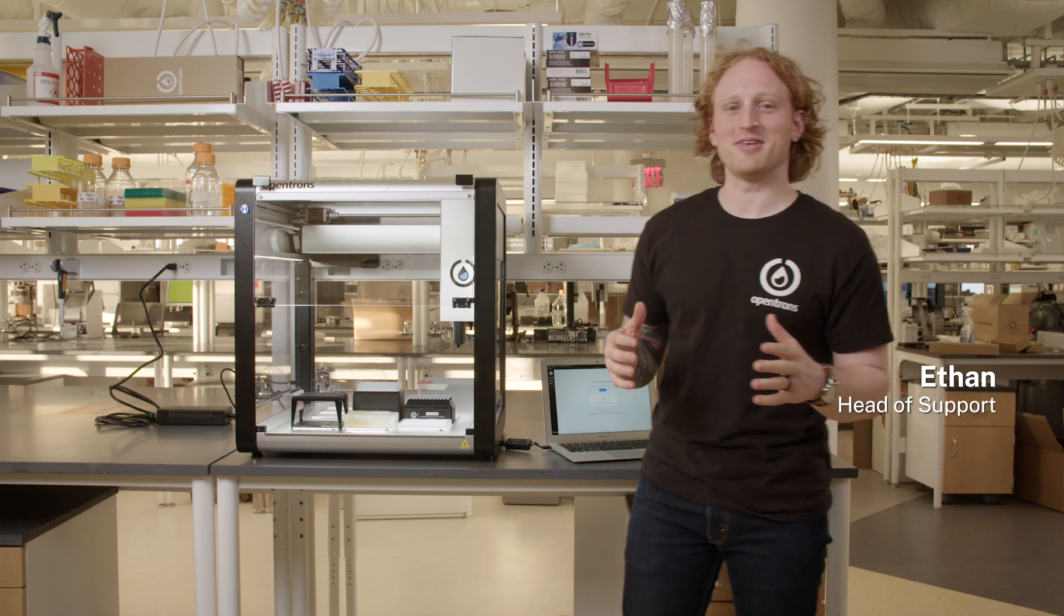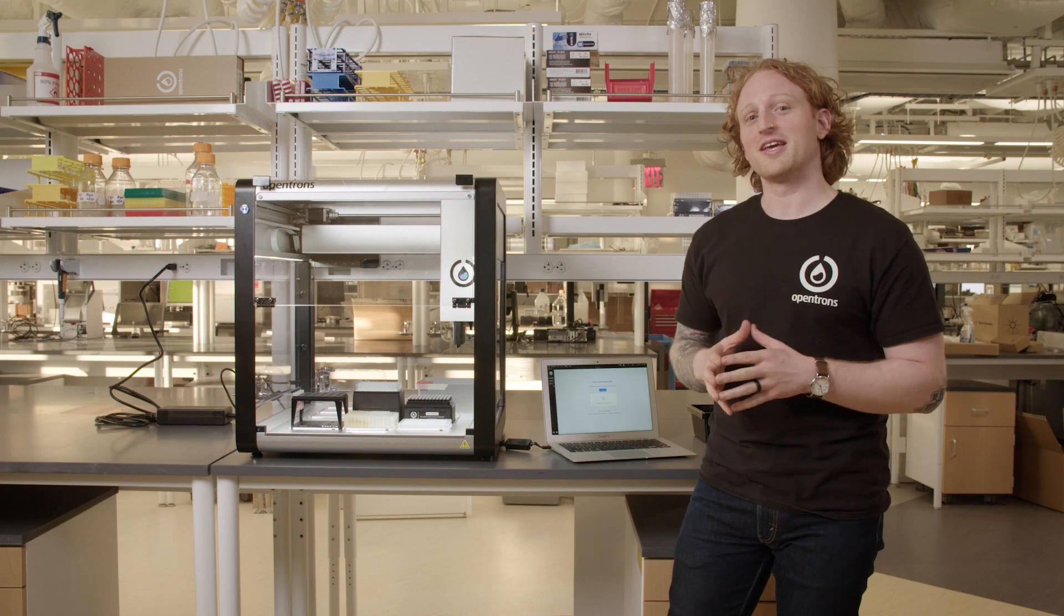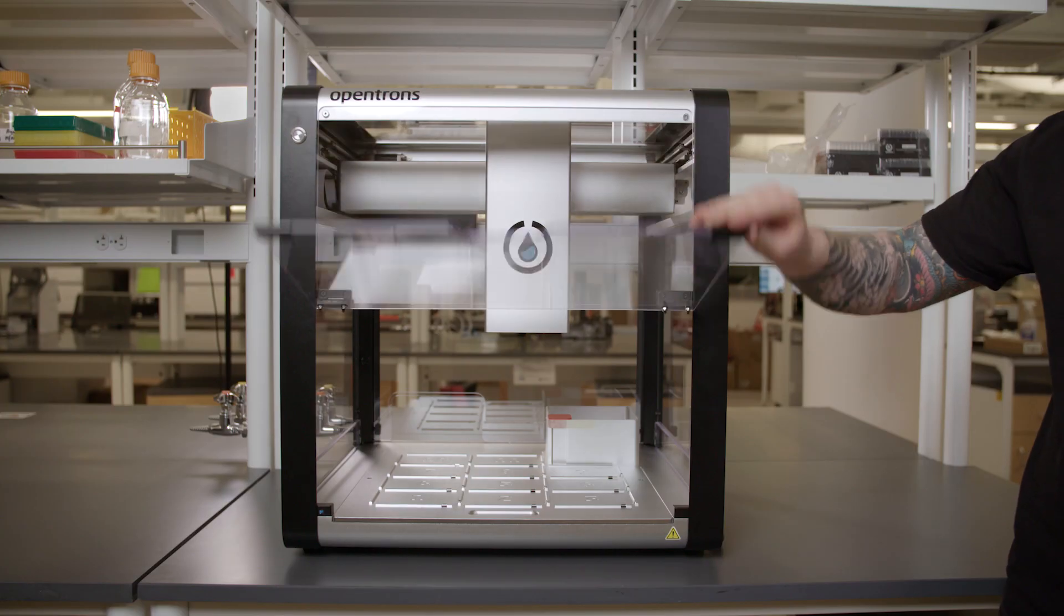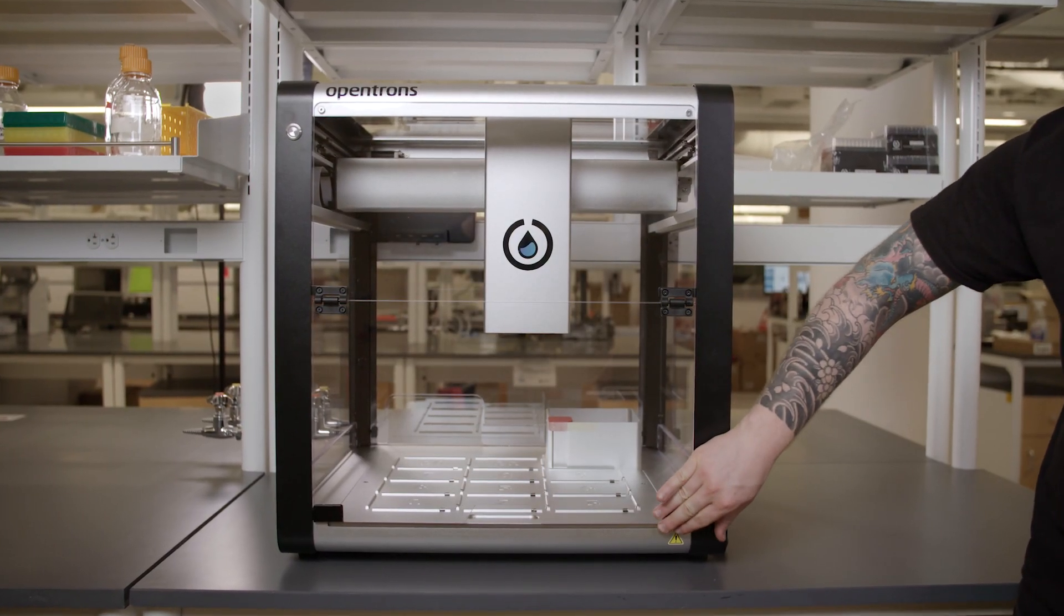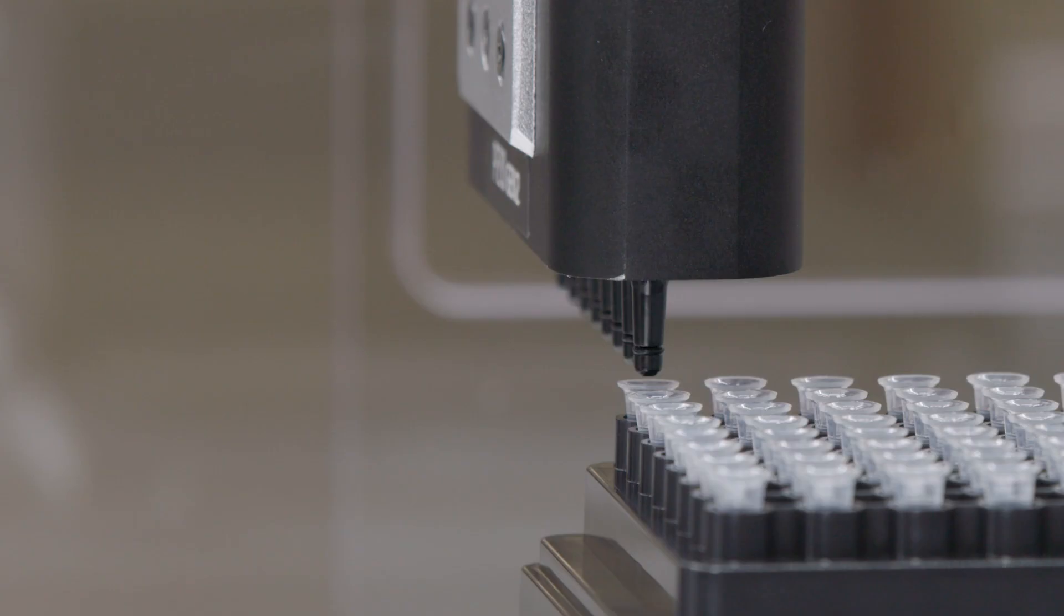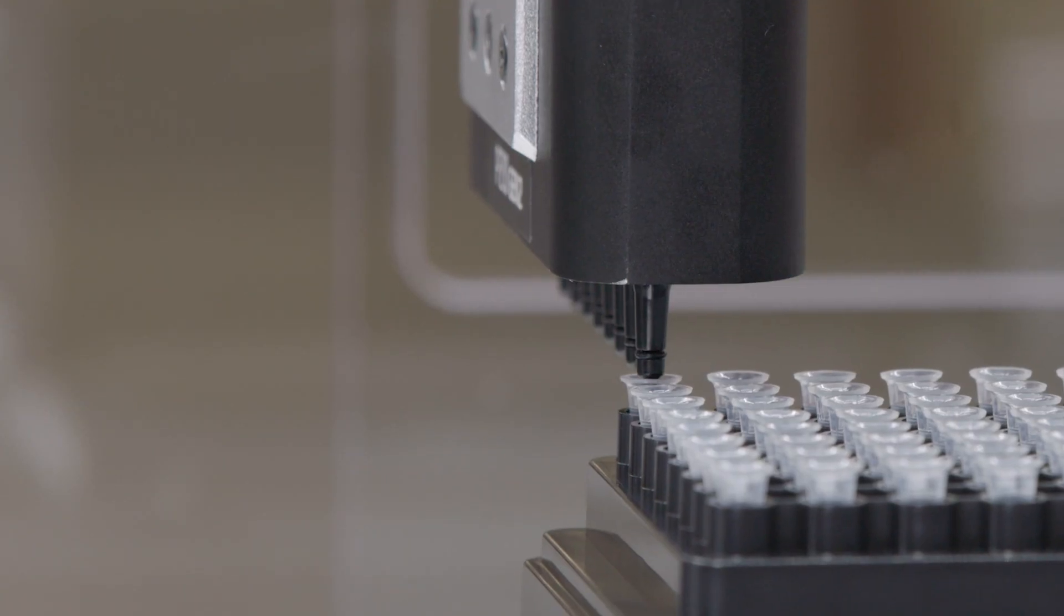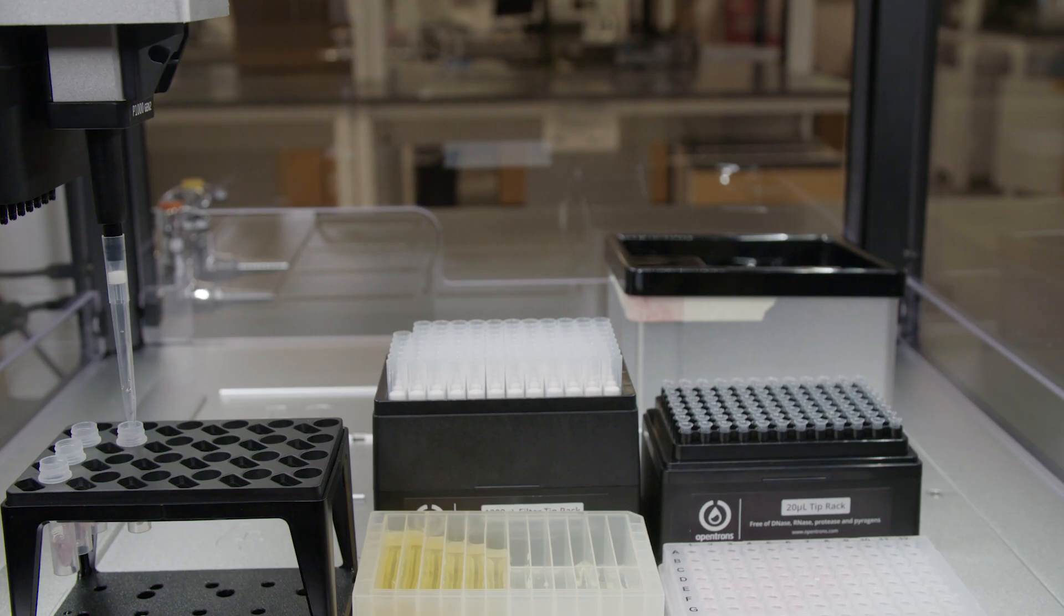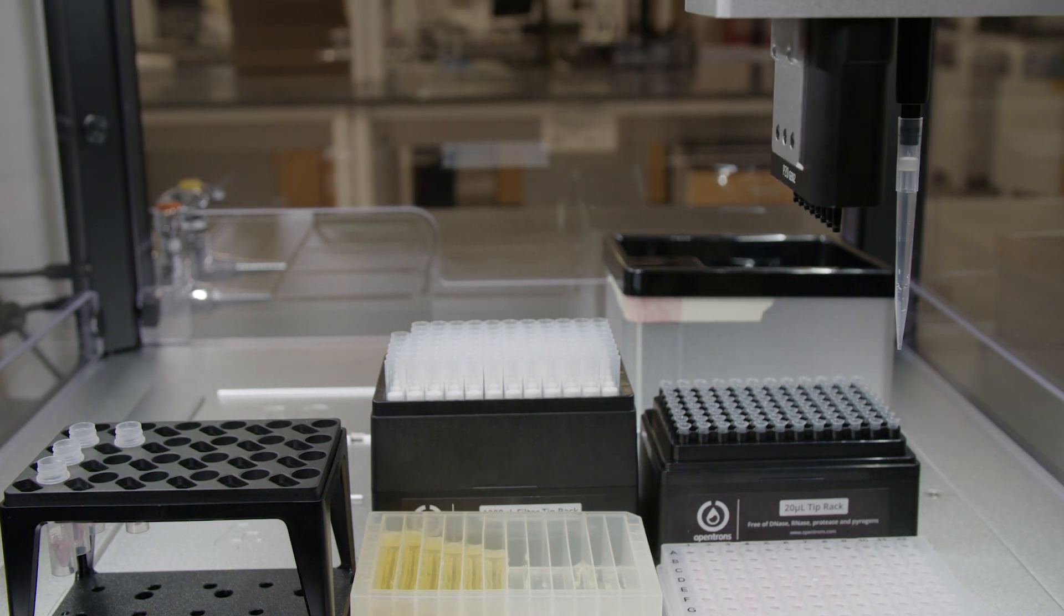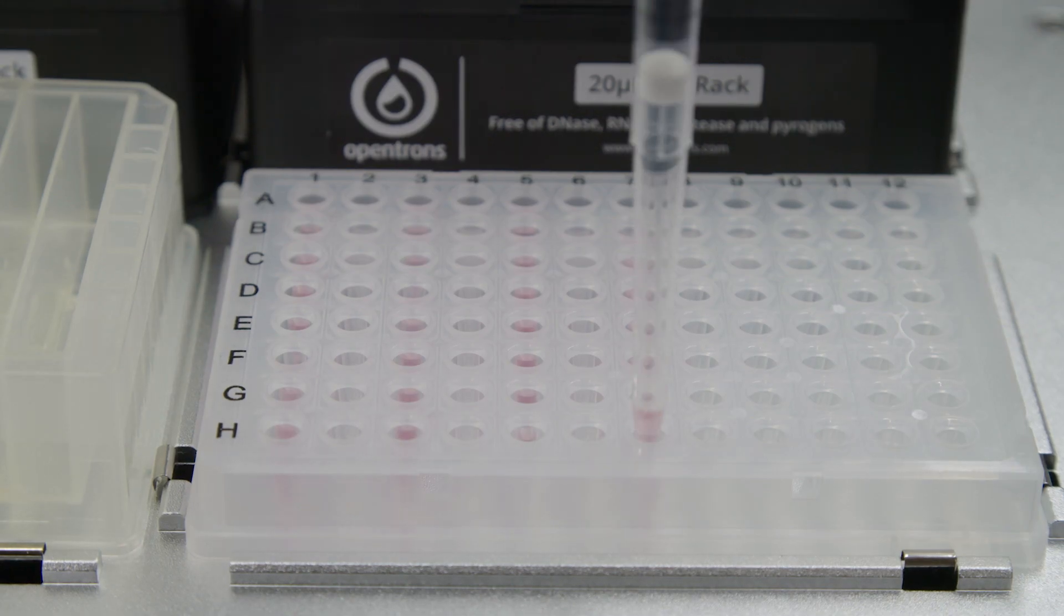Hello there, I'm Ethan, the Head of Support at OpenTRONS. This is the seventh video in a series we are calling From Box to Protocol. I just completed the tip length and pipette offset calibration, so let's get started with how to upload and run a protocol.